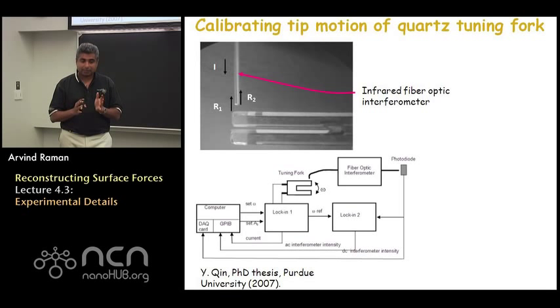There are many details about these kinds of proximal probes, which I can't go into right now. But the key point here is, at some point, one needs to be able to map the amplitude as measured in the current signal to the actual amplitude in nanometers. And this is a frequently used method to really calibrate the measured signal.